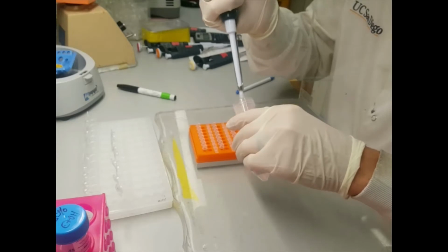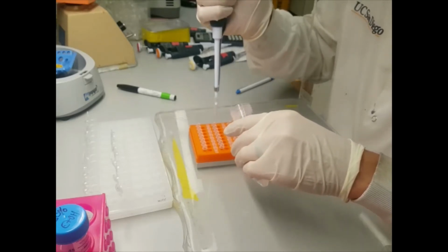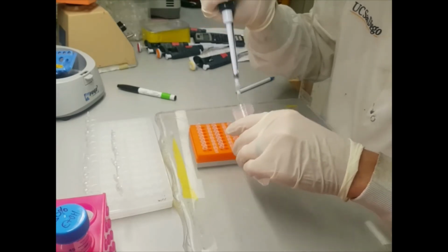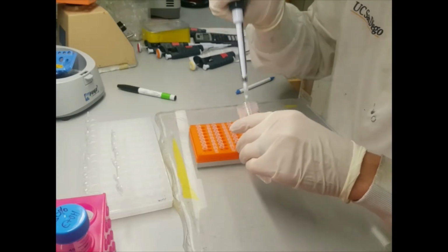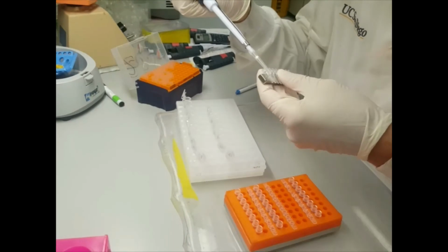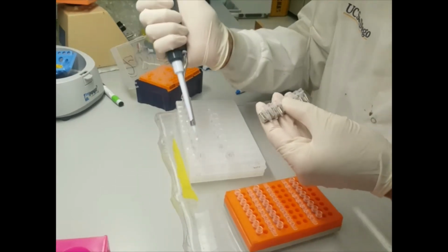Following the incubation, add 150 microliters of TET to the CIP reaction. This is just done to increase the volume of the reaction. Keep the samples on a magnet and pipette the samples, starting from the bottom of the PCR tube, into the 1.5 ml tubes. Do not transfer the beads.